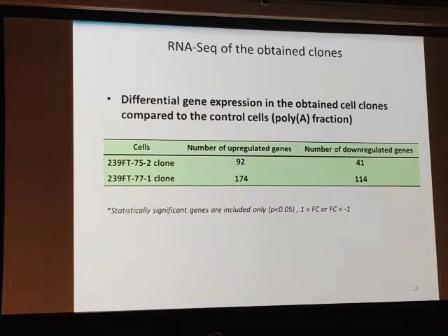Analysis of differential gene expression in the obtained clones showed significant upregulation of a number of genes in the poly A fraction in the obtained clones.